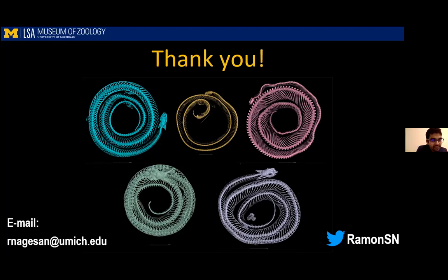Last question, it looks like: how many times do you expend to scan a mammal skull? I think you mean how long does it take to scan a mammal skull? It can take about 15 minutes, generally speaking.